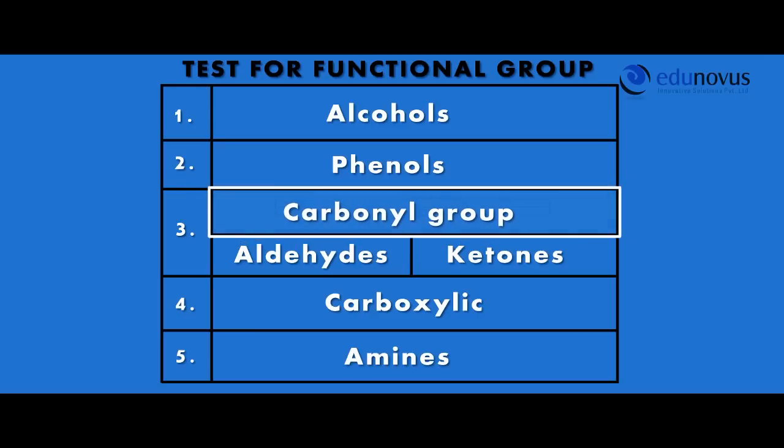Carbonyl group test: aldehydes and ketones are the compounds that contain the carbonyl group. First we will perform the test for the carbonyl group, and then we will perform the respective differentiated tests for aldehydes and ketones.